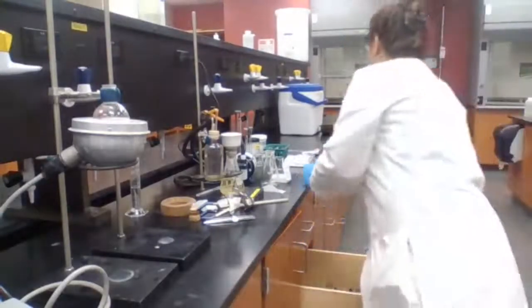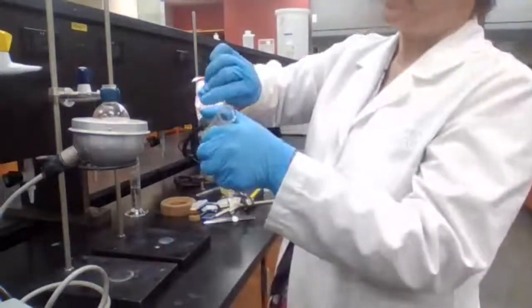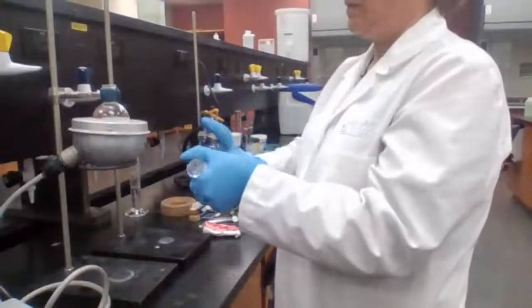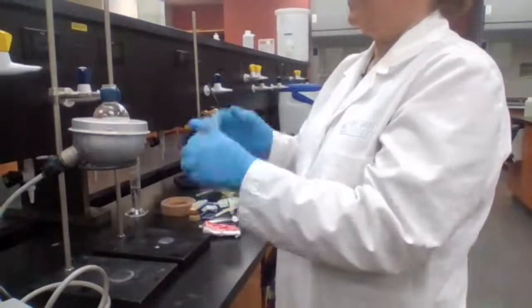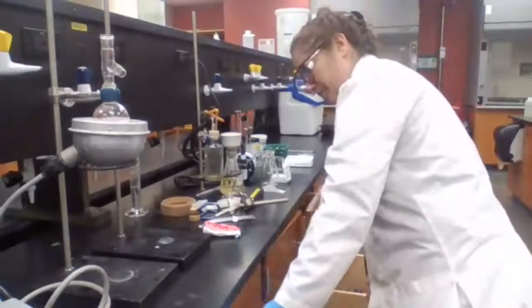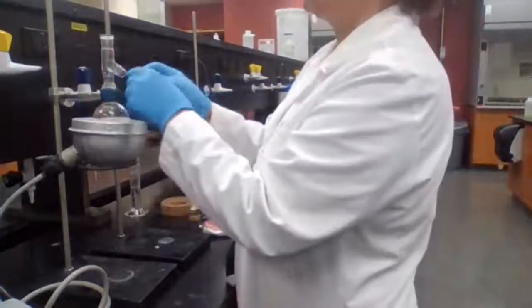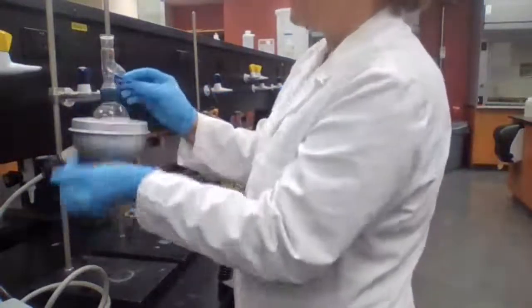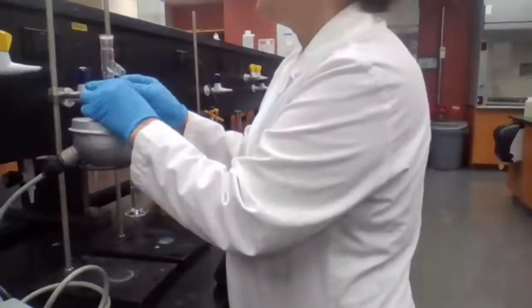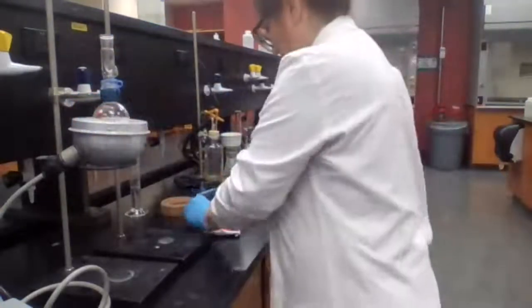Then the distillation head, but make sure to grease the glass joints. I'm going to try to use this to support it, to make sure I have a sealed system.